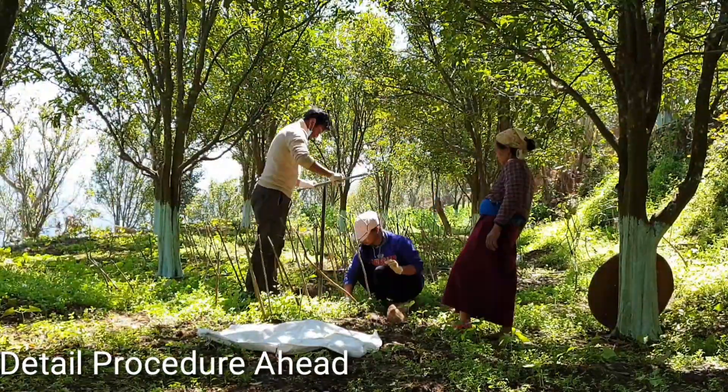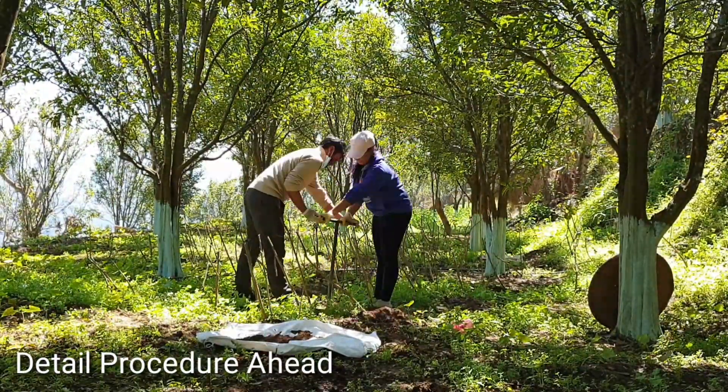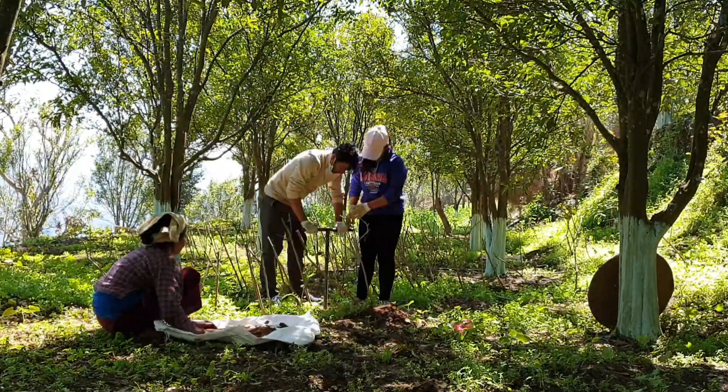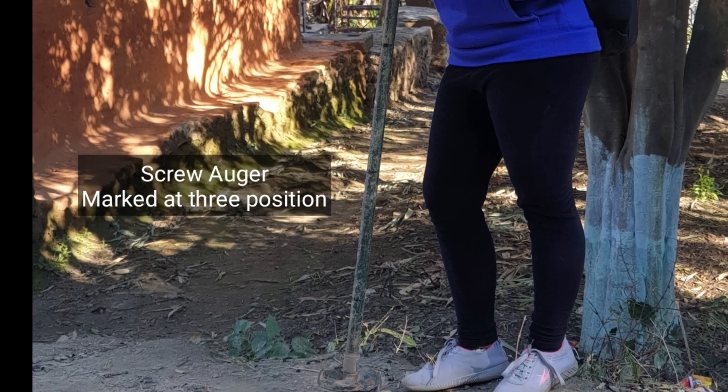We are collecting a soil sample from an orchard using a screw auger. In an orchard, we have to take the sample from 1 meter depth, so on the auger you need to mark the positions at 1 foot, 2 feet, and 3 feet.